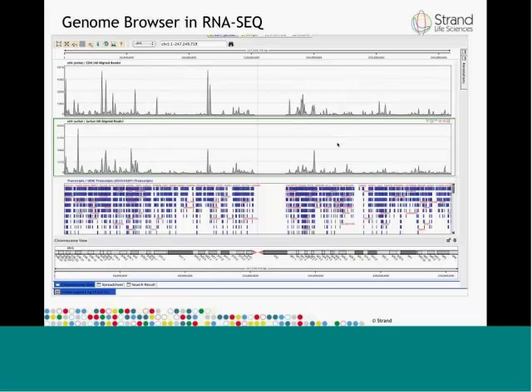If you close this experiment and close Avadis, and at a later date open the same experiment, this is the same default view that would show up. At this stage, when you've just created your RNA-seq experiment, it's recommended that you spend some time looking at the coverages from each of the chromosomes.